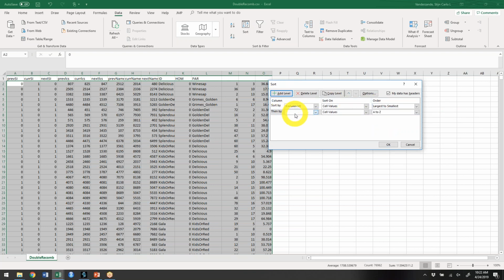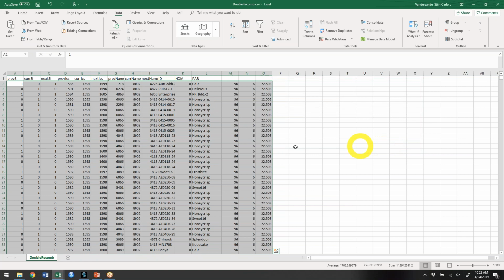And then, should there be multiple markers that occur an equal amount of times, I just want to group all the same markers. And so I'm just going to look at them chromosome by chromosome if that's the case. So I'm just going to sort on column N, which is the chromosome number, and then should there even be multiple on the same chromosome, I want to sort them going up. So I'm just going to sort them according to their position too.